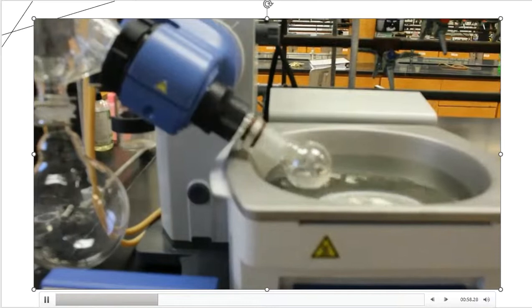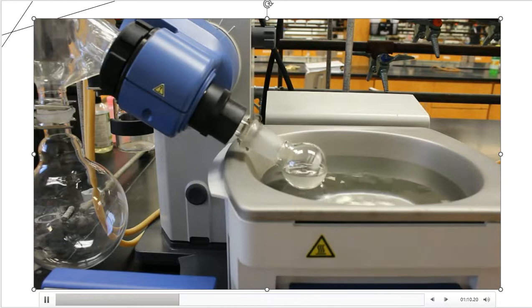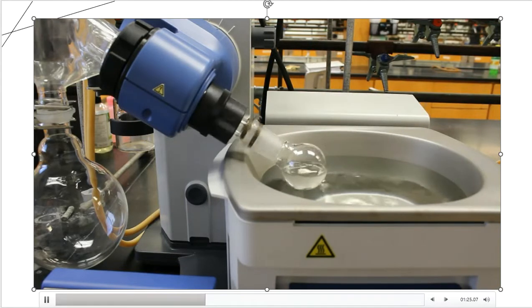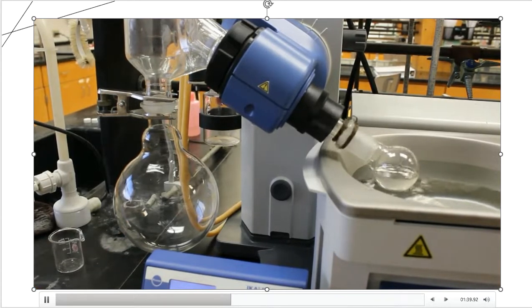So let me zoom in and give you a better view of what's going on. I'm just going to push the button on the water bath, and we are going to get this to begin to heat. It will get above the methylene chloride boiling point, which is actually very low. And then it will start distilling off the methylene chloride that is here in my boiling flask. After that begins, my methylene chloride goes around to the left, and it will eventually make its way here into a receiving flask so I can use it for another purpose if that's what I want to do.